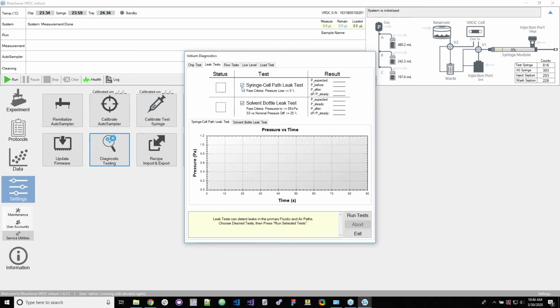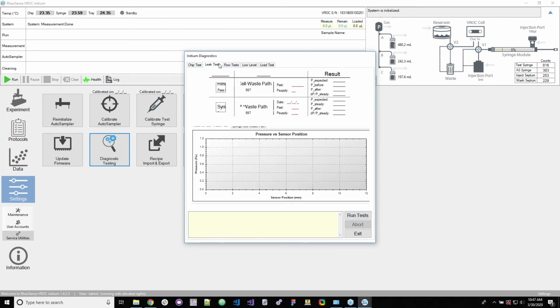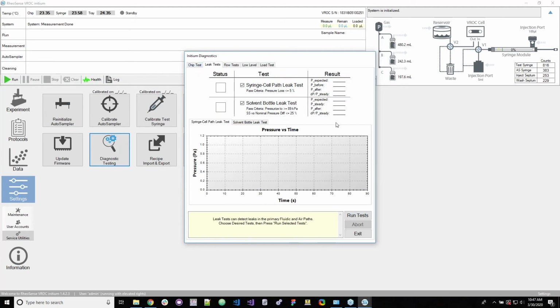And then you can select which kind of tests you want to run. When you click run on the instrument, it's going to go through and run these 5 tests for you to make sure that the instrument is running properly. But if for whatever reason the instrument fails when you click run, you can come over to the service utilities tab under the settings parent tab and then click diagnostic testing, and you can specify exactly which tests to run. So these 3 tabs you will probably use. So you can run these tests later.